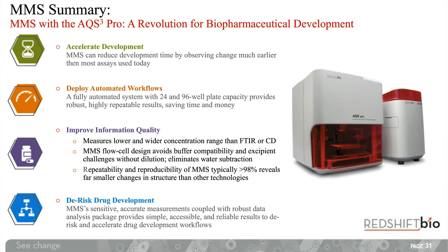And we can also use the delta plot comparisons output in the stability plot that you just saw on that last slide, which very clearly shows that there are two groupings of samples, not just when you look at one type of secondary structure, but here, because we're using the full spectrum, across all the different types of secondary structures present within those samples.